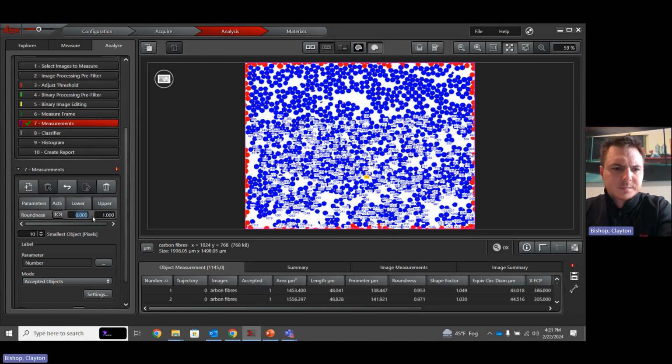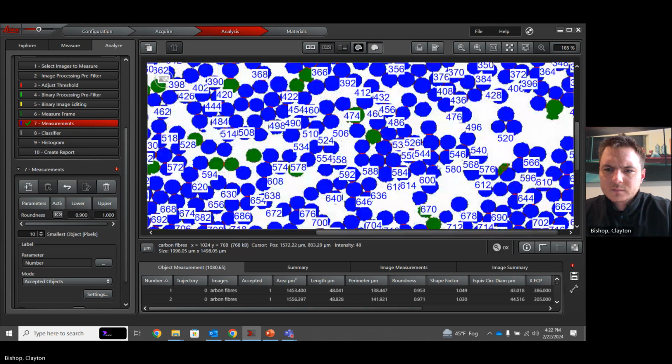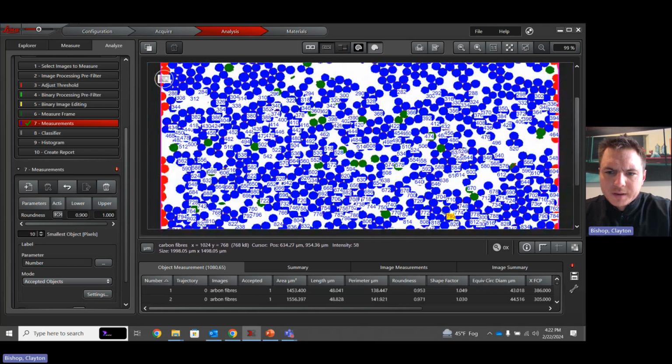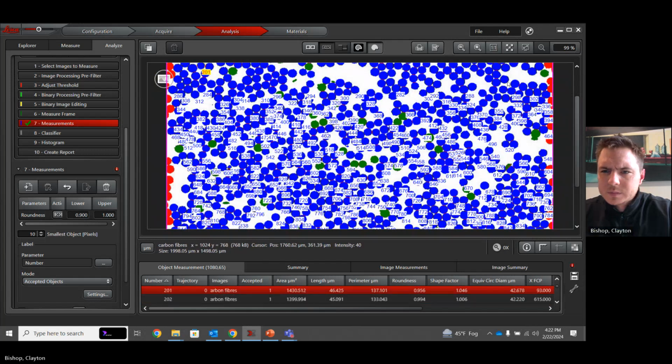Now I'm going to go here. I'm going to say 0.9. Now we're excluding 65 of them. We can look in here at what is being counted, what is not being counted. A lot of count going on in here.